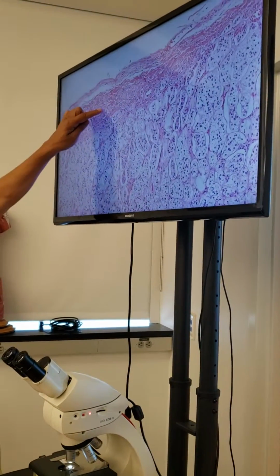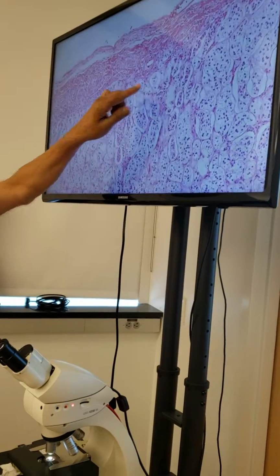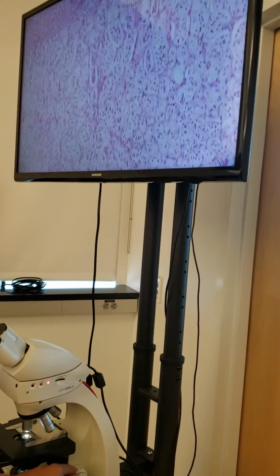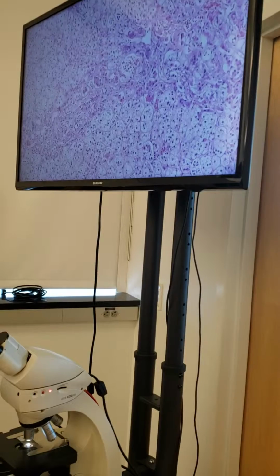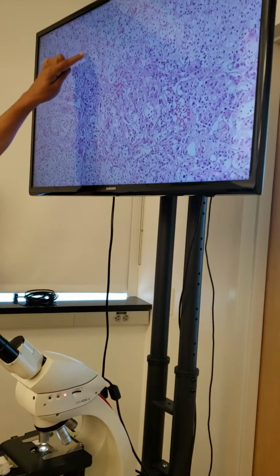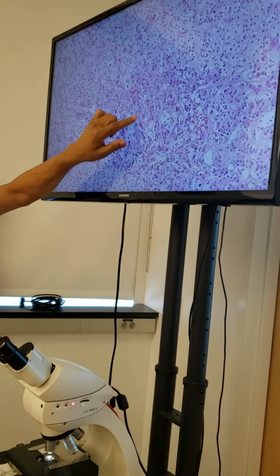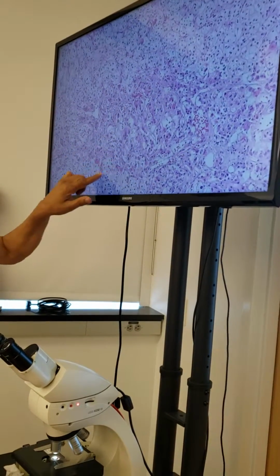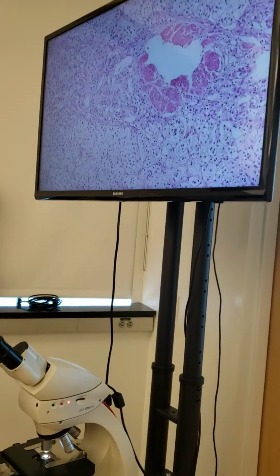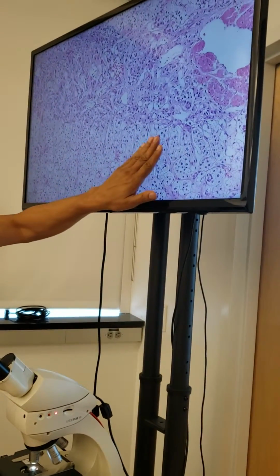See this thing here, capsule? See this thing, look at circle, right? Isn't it? Glomerulosa, like circle. And you notice the difference here between cortex and medulla? This cortex has a lighter color, this medulla looks a little darker, right? Does it look good or no? See this boundary line between cortex and medulla?